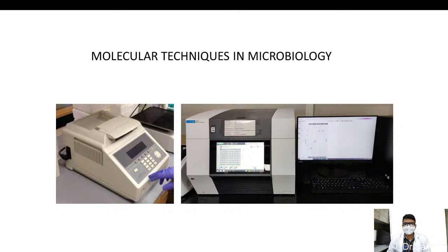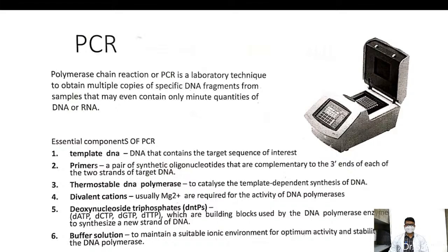Good afternoon, everyone. Today we have a practical demonstration for molecular techniques in microbiology. I'm here to show some of the instruments and articles that are used in our molecular techniques. So the molecular technique that is used in microbiology is PCR, polymerase chain reaction.